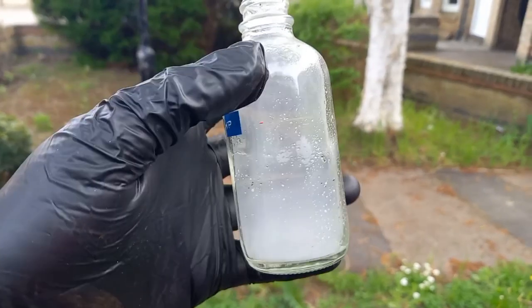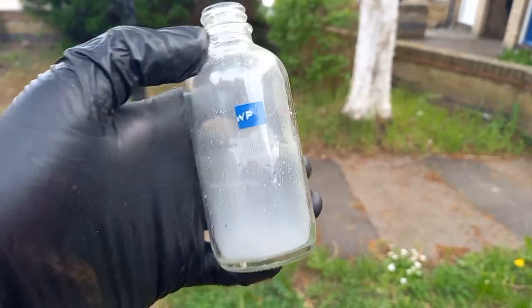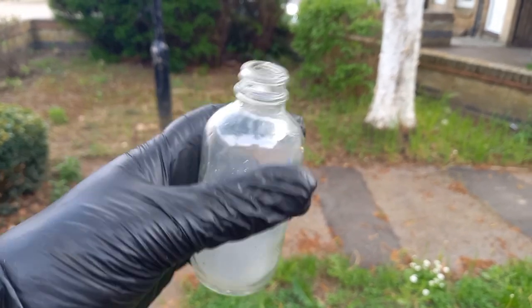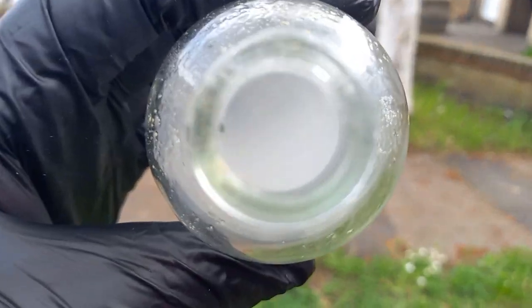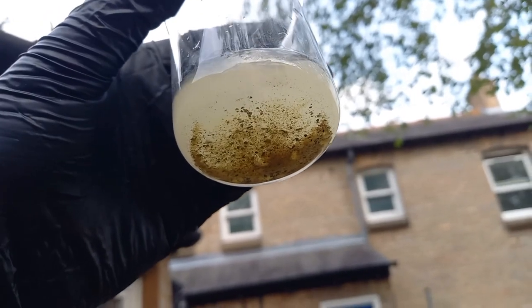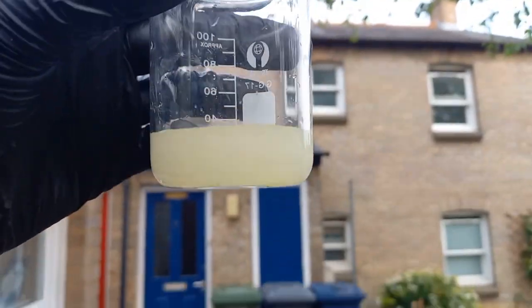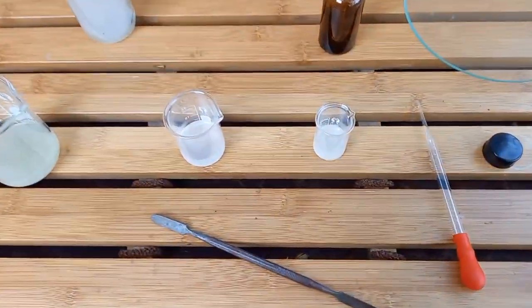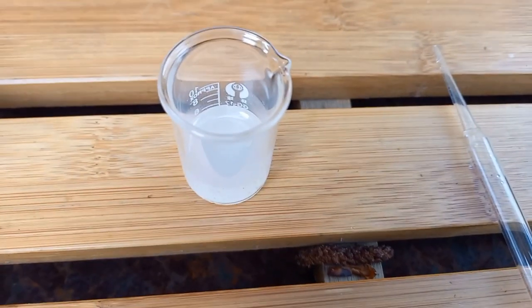There are still bits of phosphorus in there which are reacting with the air to produce phosphorus pentoxide, which is not great to breathe. The remainder of my dirty white phosphorus is in water, but I'd still like to try and get some of the small chunks in there to dissolve.